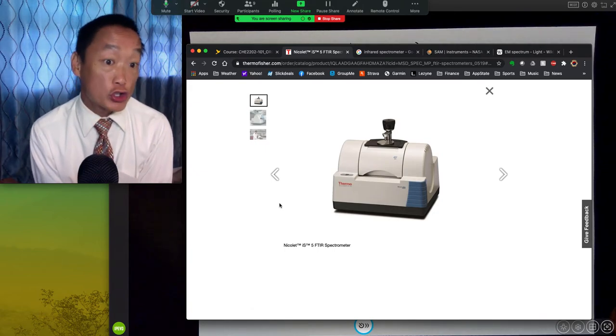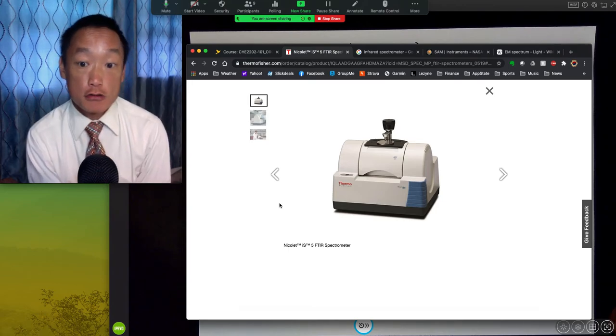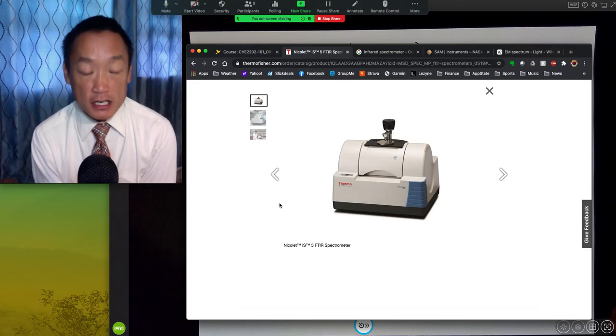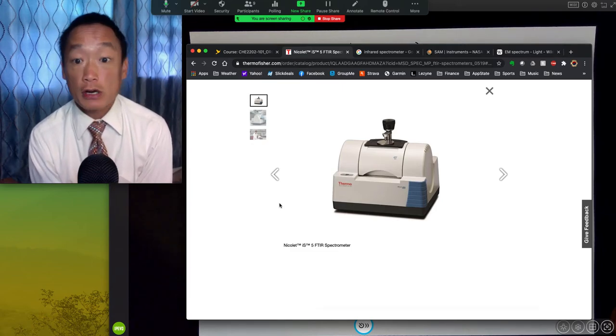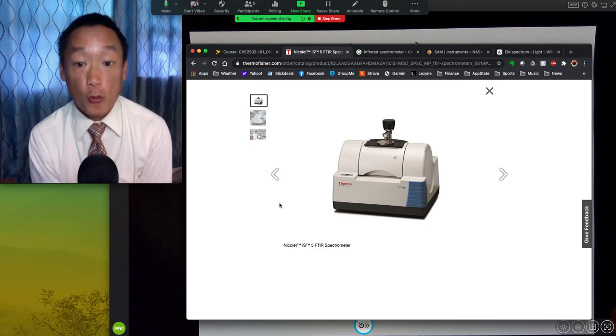Work being motion, work being heat, work being something that can be used to impart some type of Newtonian physics. Since we don't do any work on our system, these things are called instruments. So don't ever make the mistake of calling these things machines. They are not.